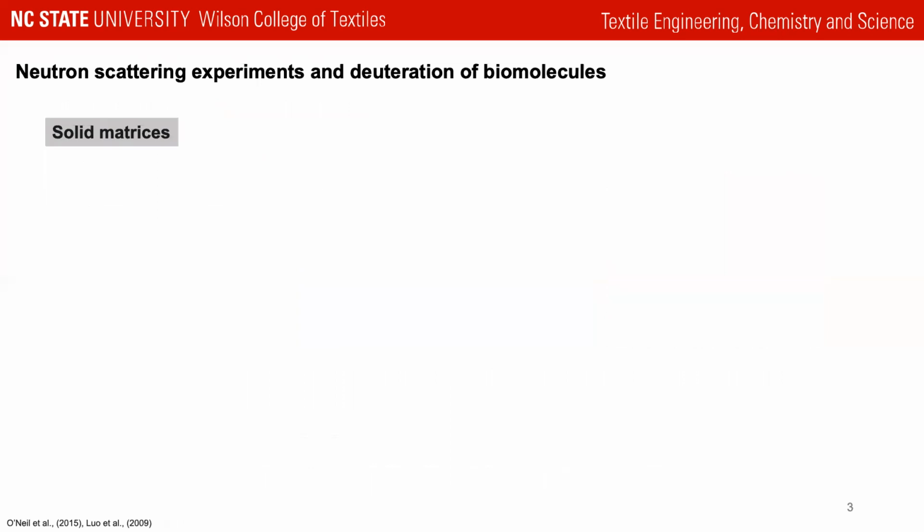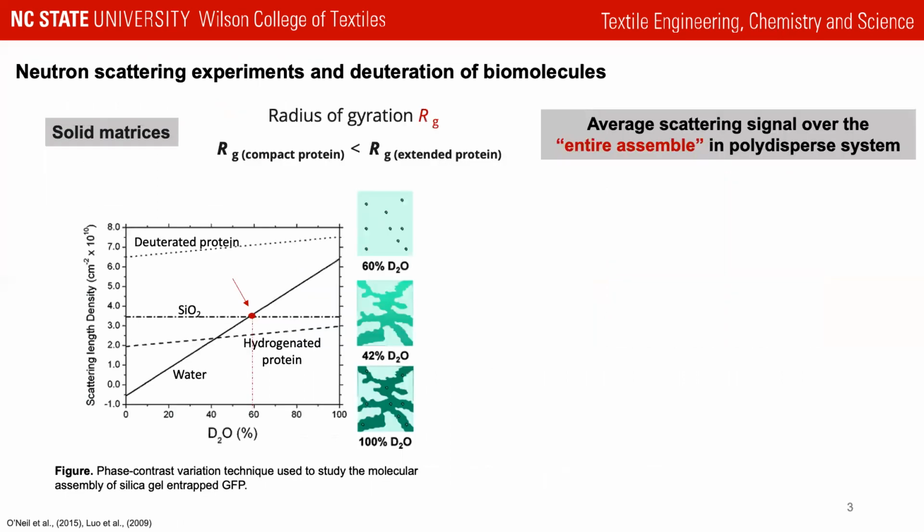In applications of chitosan composites, it is very interesting to study the structure-function relationship using neutron scattering techniques through characterization of composites in solid states. For example, neutron scattering can be used to study structural features of entrapped enzymes in a solid state. The radius of gyration of molecules can be obtained from scattering intensity with a mathematical model, and this parameter is correlated to the difference between well-dispersed or aggregated molecules.